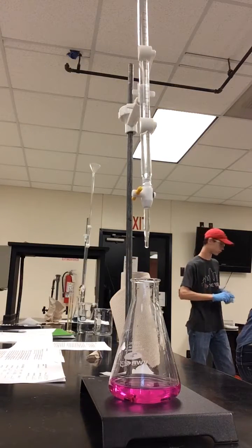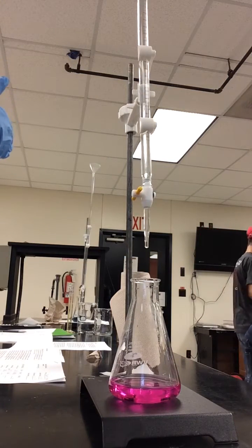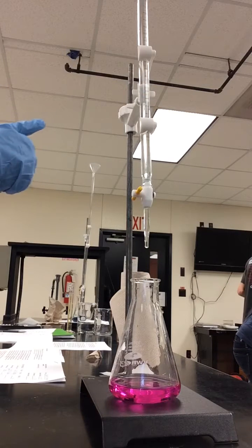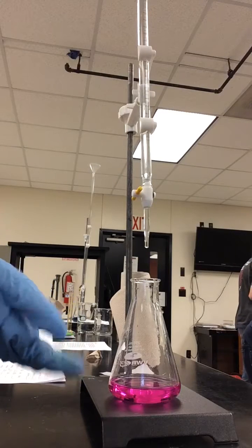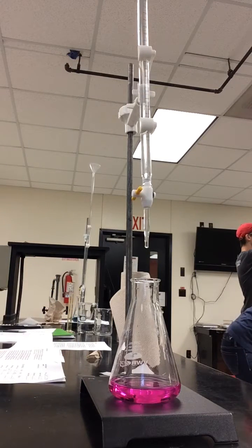Well, you only want it on the edge of the color change, remember? So it's like once the green is gone, not whenever you have a good blue. Because we didn't do it to where we had a good pink like this. We only did it to where the pink started. Because you want to find the edge.